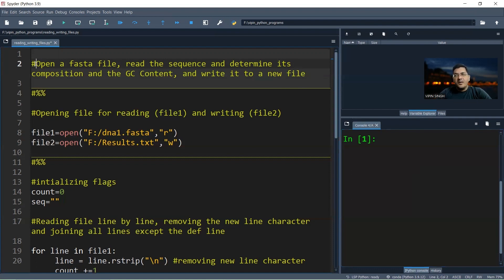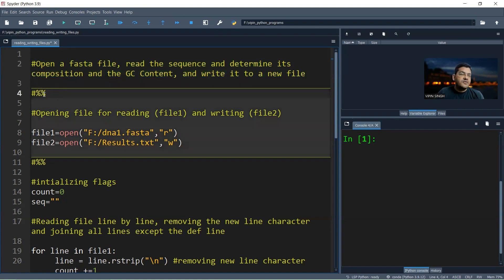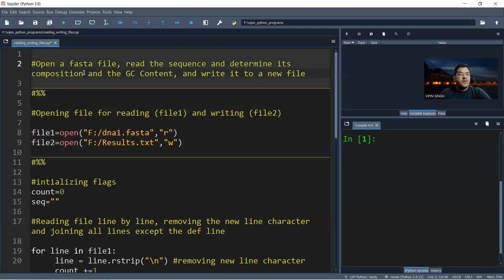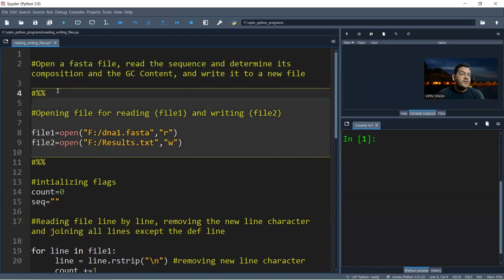A hash indicates a comment — whatever you write next to a hash will not be executed. In Spyder, similar to Google Colab, you can create chunks of code that can be independently run. You create a chunk by starting it with the hash-percent-percent sign. In this program we are going to open a FASTA file, read the sequence, determine its composition and GC content, and write the results to a new file.